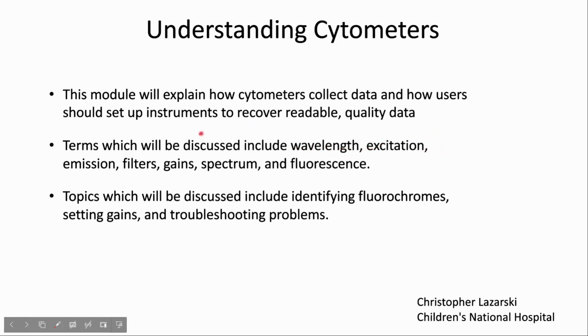Terms which will be discussed include wavelength, excitation, and emission, as well as filter sets and corresponding gains, along with the spectrum from fluorescence markers. Topics which will be discussed include identifying fluorochromes, setting your gains, and troubleshooting problems which you may encounter when collecting your samples.